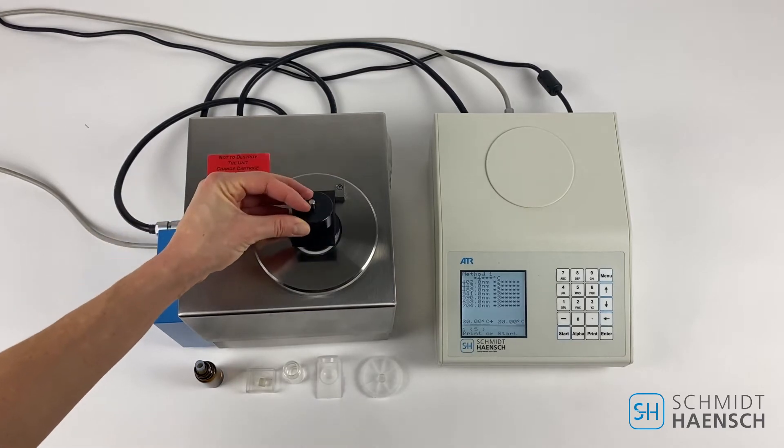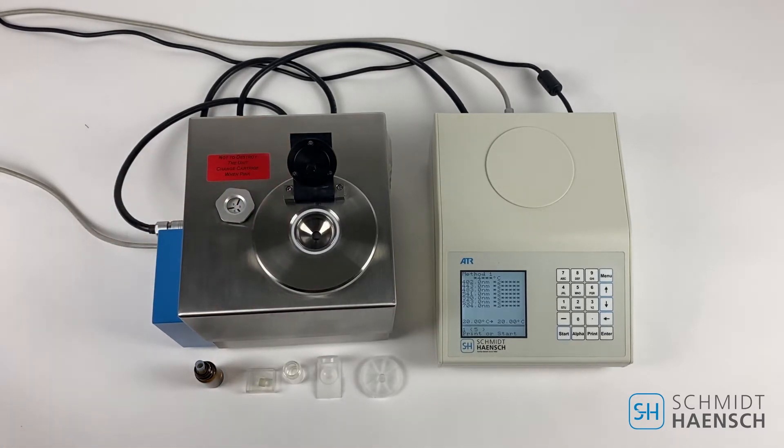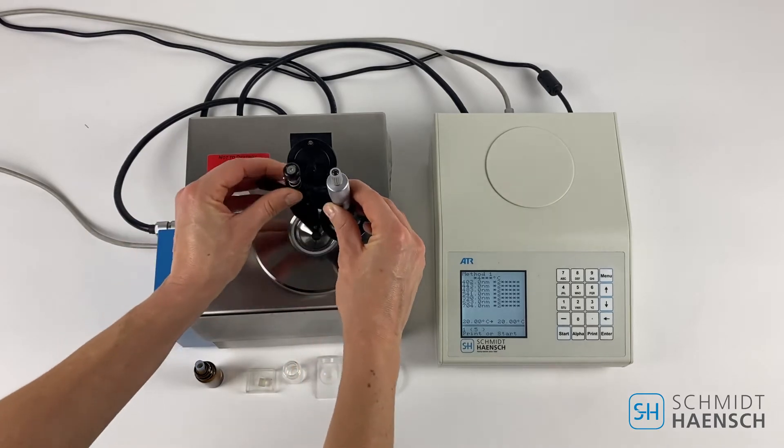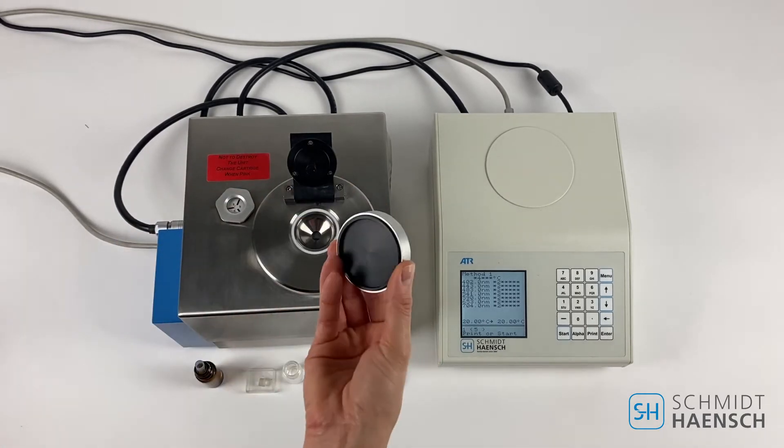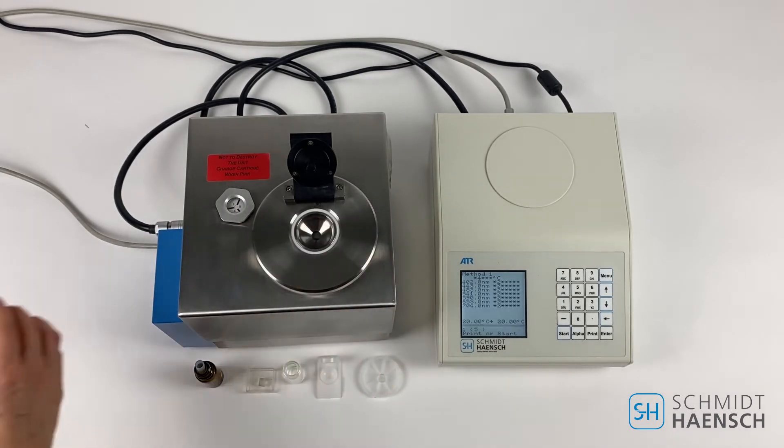We have several lids for the prism surface: a pressuring lid with detailed pressurization, or a loose lid cover.